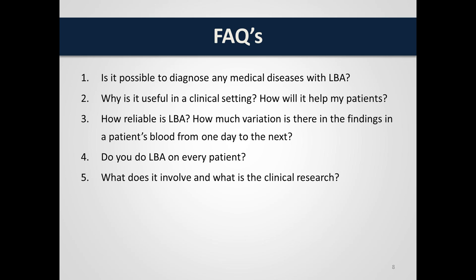The dry blood sample is viewed after the live sample under a lower magnification, looking at the specific pattern of coagulation. Now, in essence, it's a nutritional test, so we can see nutritional imbalances and other imbalances that can be addressed with changes in diet and lifestyle and specific natural treatment interventions. As I mentioned earlier, it's not used as a tool to diagnose medical diseases.